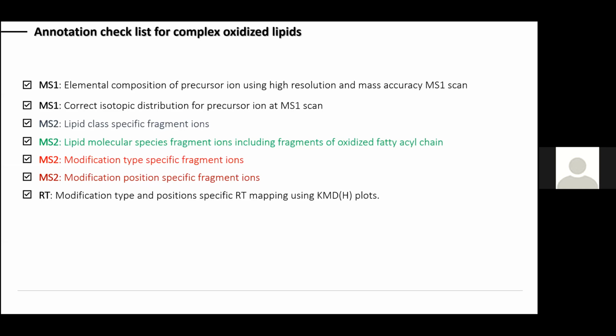have many lipids identified, dozens of them, then of course we plot them using Kendrick mass defect by hydrogen usually, but sometimes you can also do it by oxygen here, which really helps you to eliminate some false positive identification specifically for the isomeric lipids, for instance, epoxy versus hydroxy and so on, because they have very defined retention time behaviors.